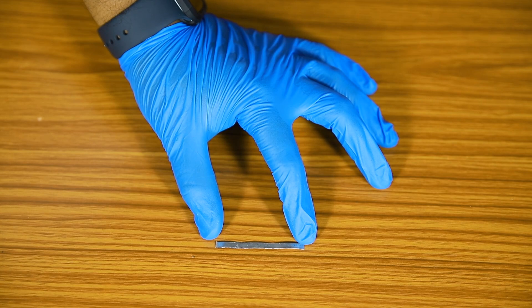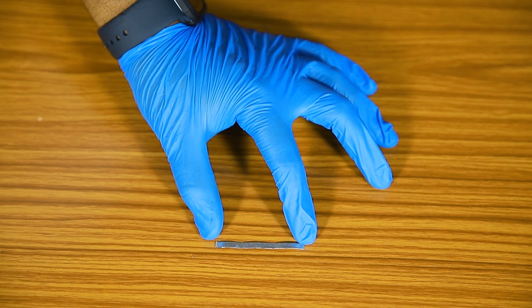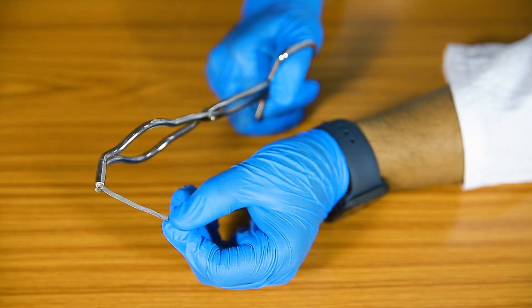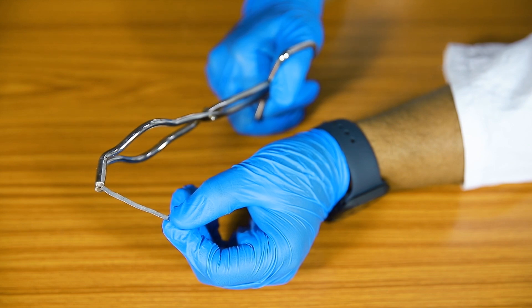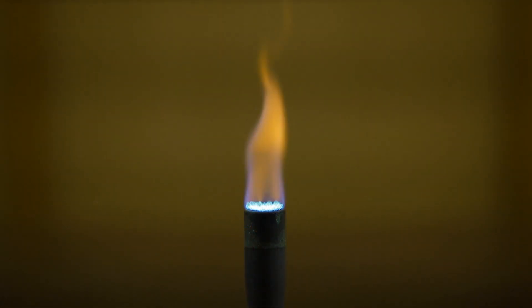Take about 5 centimeters of magnesium ribbon and hold it with the help of a pair of tongs. Bring the free end of the magnesium ribbon near the flame of the spirit lamp and let it burn.